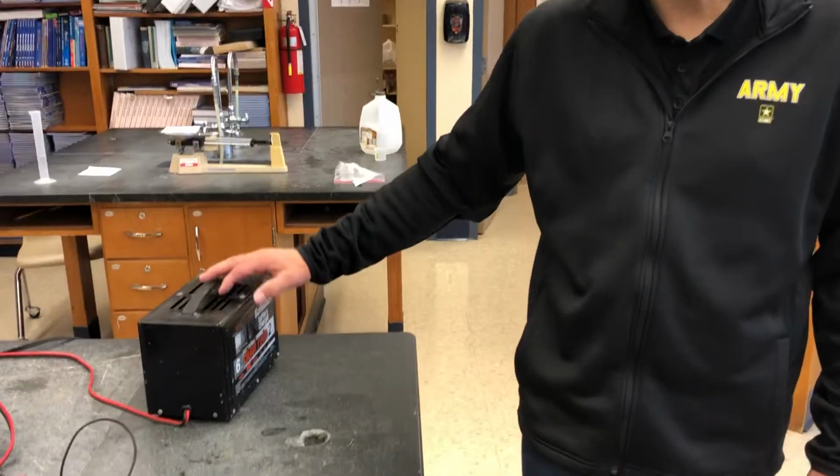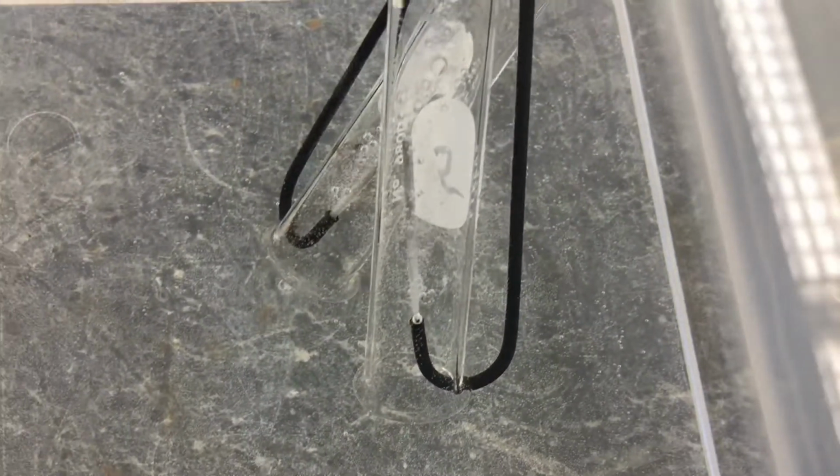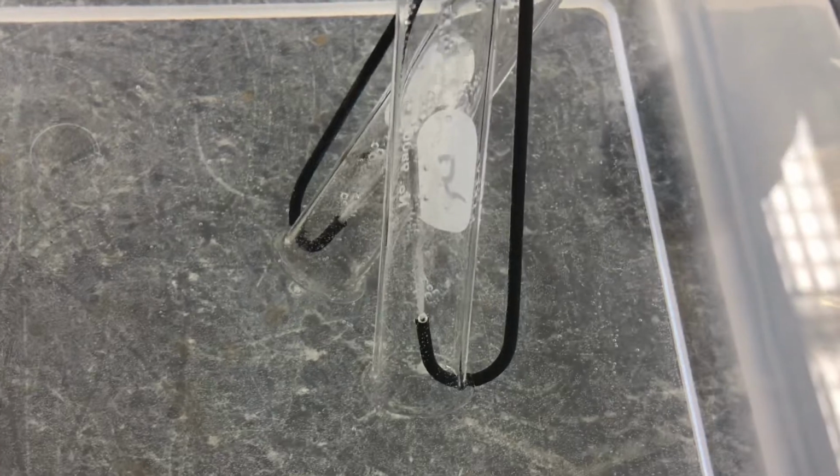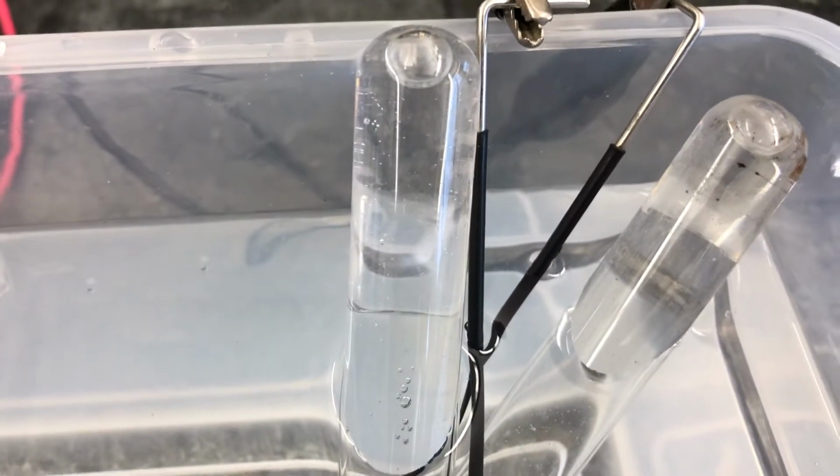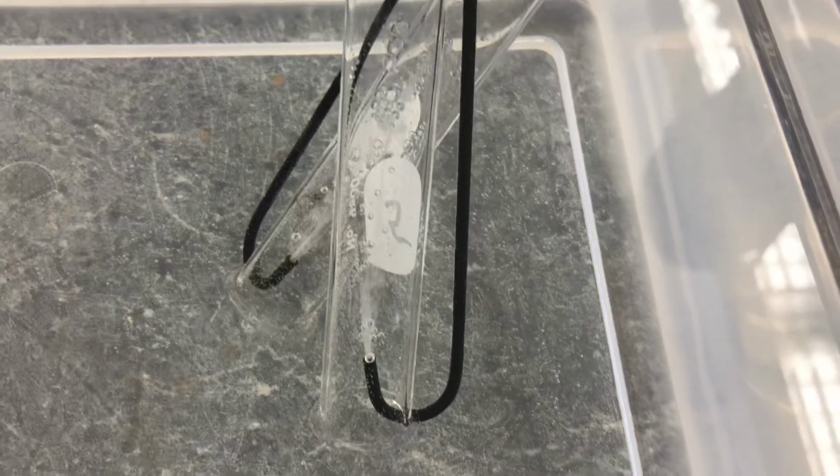And so what I'm going to do is I'm going to turn this on. And it's a little bit hard to see in the camera, but the one way that we know it's working is it's bubbling. I can see bubbles inside of that one test tube. You may or may not be able to see those particular bubbles real well. You have to look really, really close. Now, the hydrogen side is bubbling much quicker than the oxygen side. And if you keep in mind that the formula for water is H2O, we should be producing more hydrogen.